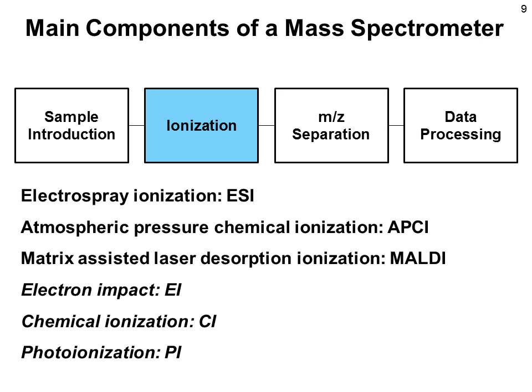Finally, we have photoionization. Instead of shooting electrons at the molecules, you can shoot photons at them with a high-intensity lamp. These photons can be absorbed by certain molecules, if they have chromophores, and then, due to the absorption of high-energy photons, molecules will be ionized. We will not deal with this ionization method in this course either, as it is also not used very much for biological molecules.